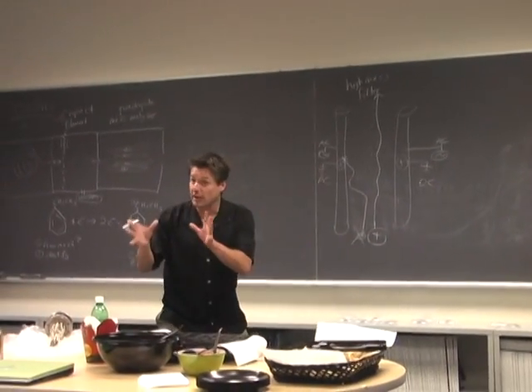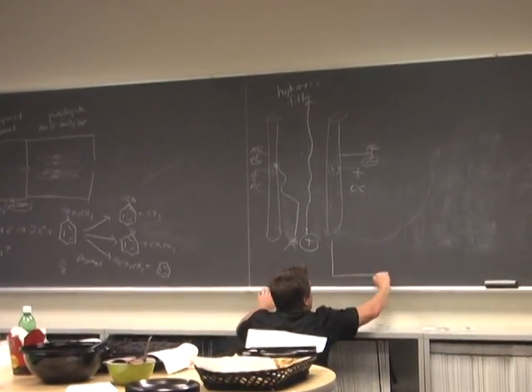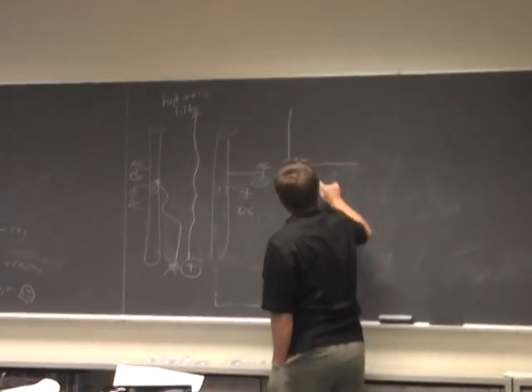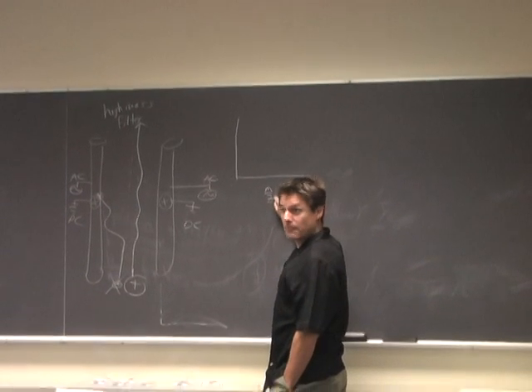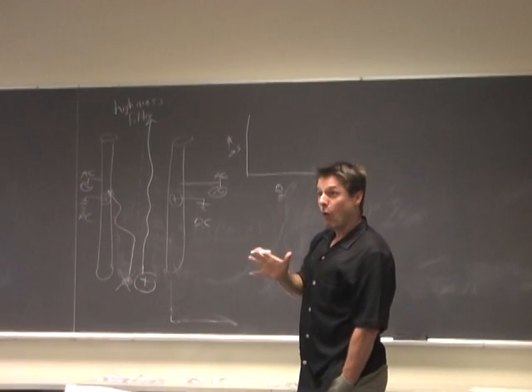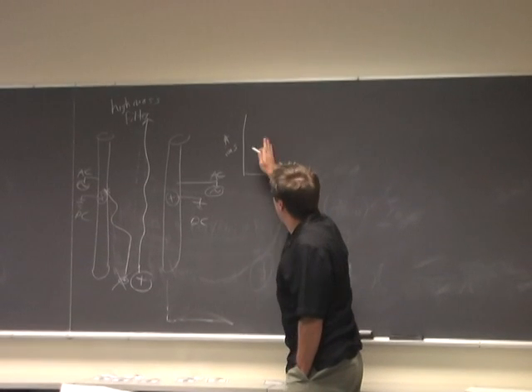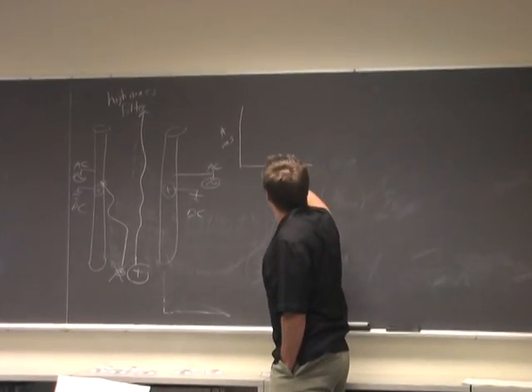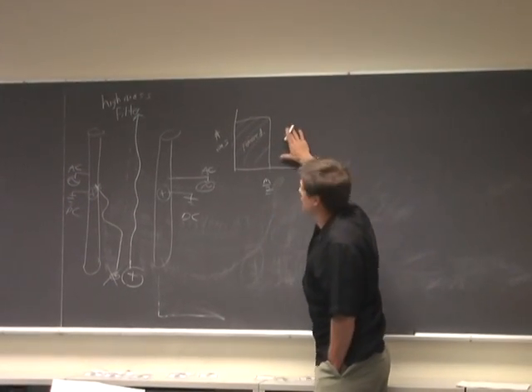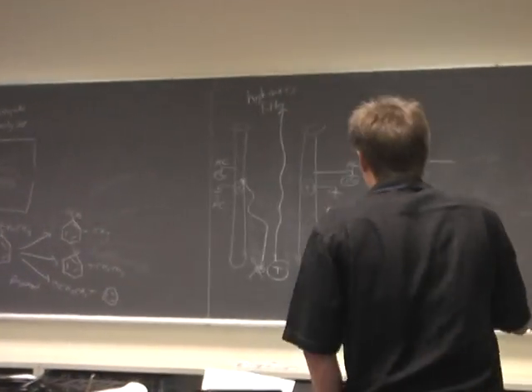So if we took a look at a plot of what comes out the other end, and we drew this plot, let me do it up here. So here's the plot. This is your mass to charge ratio. Here's the number of ions that get through. And based on the voltages that I set, let's say I set a DC voltage and an AC voltage, here, everything below that gets wiped out, everything above that gets through. So these get removed. That's what I mean by a high mass filter. Everything above that, the high stuff, gets through. Not too tough. Pretty basic stuff.